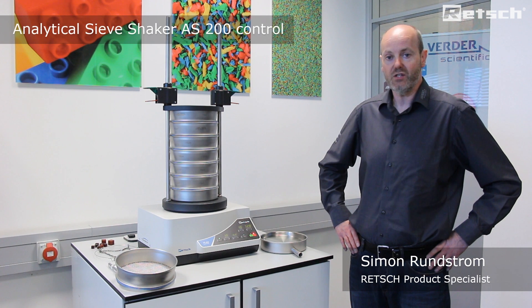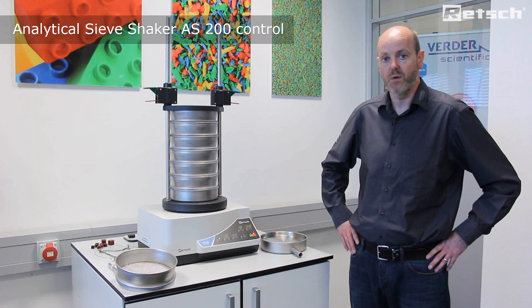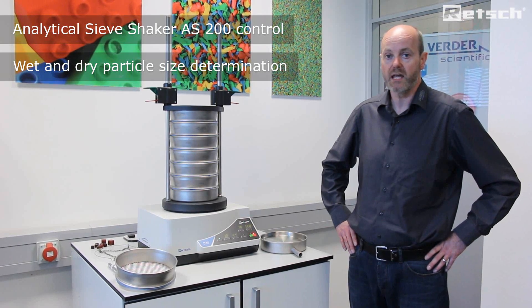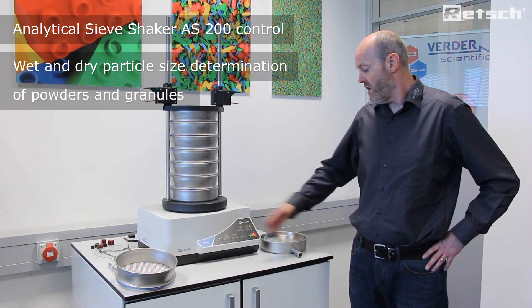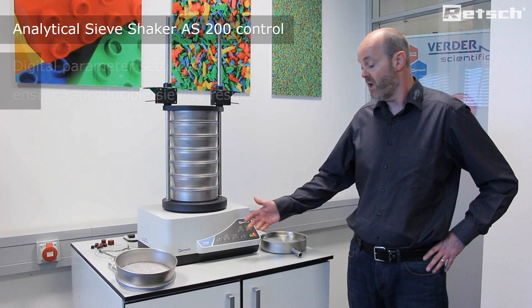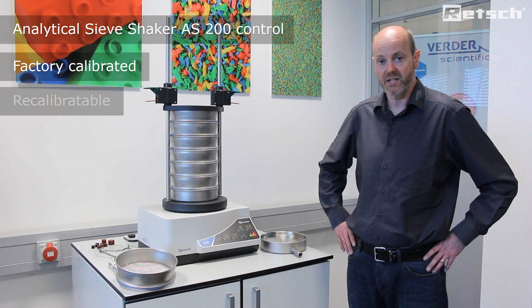Hello, I'd like to take this opportunity to introduce the AS200 control, which is a benchtop-mounted instrument within the family of sieve shakers. It is primarily used for particle size determination, both wet and dry, of a variety of powdered and granular materials. The parameter settings are all digital, which ensures truly reproducible sieving results. Furthermore, the instrument comes factory calibrated and can be recalibrated in the future as per the client's requirements.